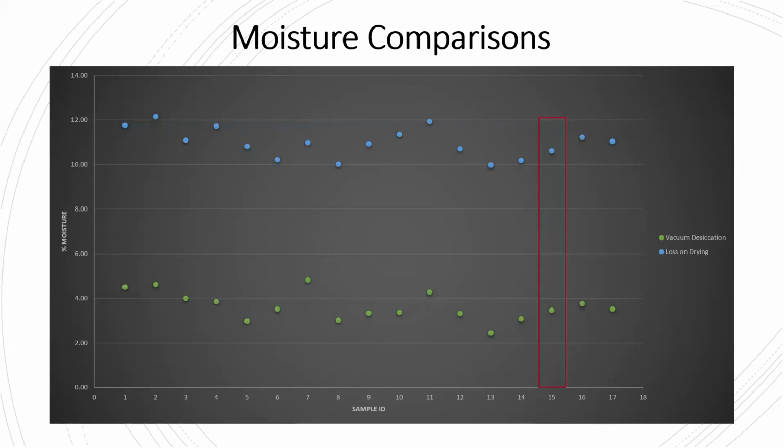Additionally, both methods obtained extremely reproducible results, and the relative percent difference between each sample for both methods was less than 1%. This indicates that both methodologies are reproducible and that the numbers obtained can be recreated. So the biggest question this data poses is, what result is more correct and which result is a true reflection of the water content in cannabis flower?